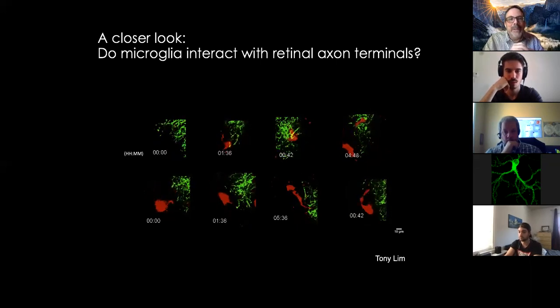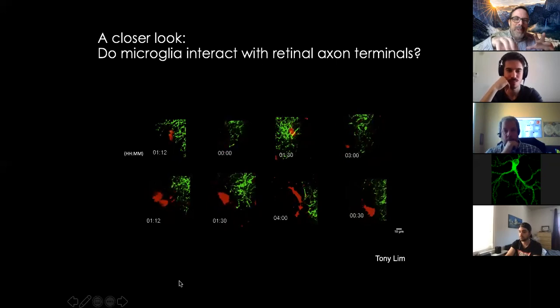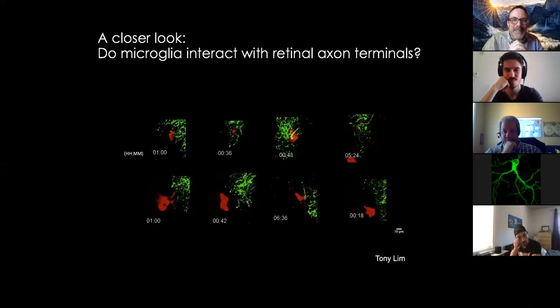But when you have the microglia there, what you can see is that in many cases, the microglia are actually sort of forcing their way through the neuropil as they wander through and explore. You can see them sort of pushing axons out of the way as they grow in, which is really amazing. I wouldn't have thought that amount of space was available for them to move through.